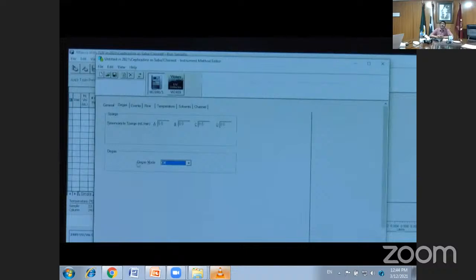If you are in the R&D phase, you just start with the maximum time and observe whether the peaks appear or not. When the peak appears, and no impurity or ghost peak appears in the second run, then we can reduce the time according to the retention time of the first run.